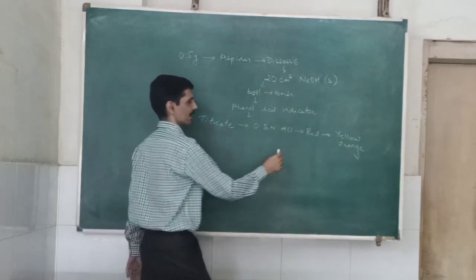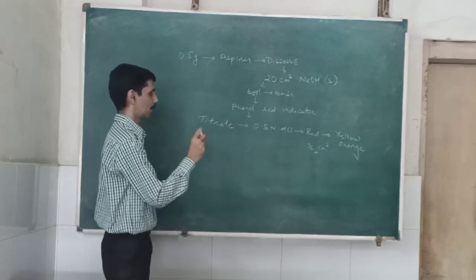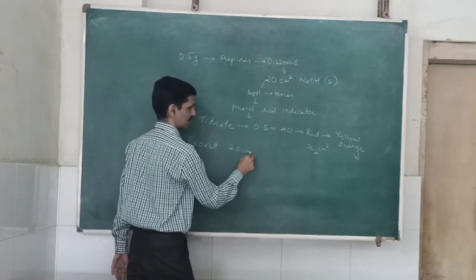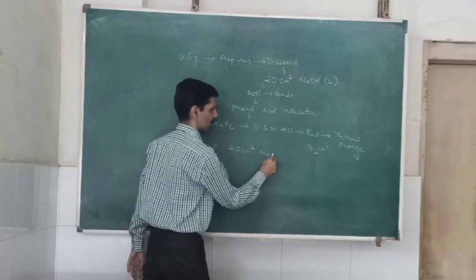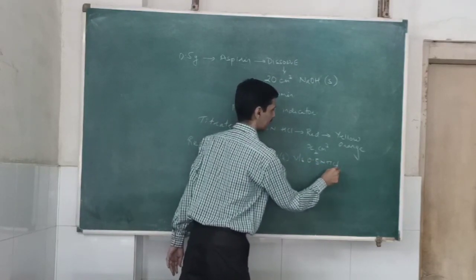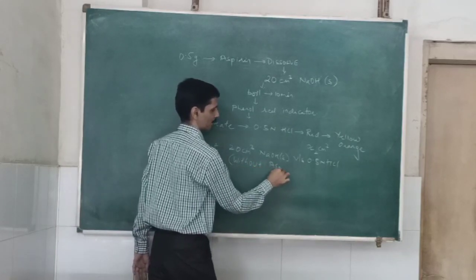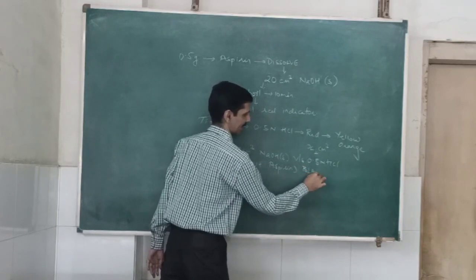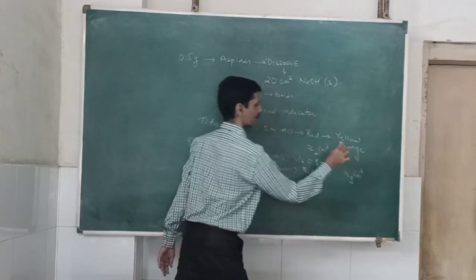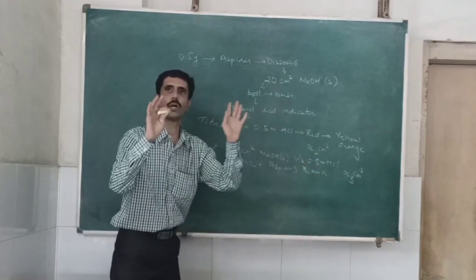Let us consider this value that we get as X2 cm³. Now repeat the same titration, that is 20 cm³ of the standardized NaOH versus 0.5 normal HCl. But this time, my dear friends, remember, it is without aspirin. So we also call this a blank titration. And suppose we get X3 cm³ as the reading. So X2 is NaOH and aspirin, X3 is only NaOH.